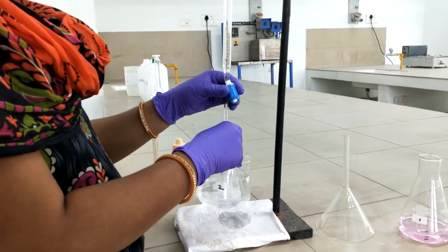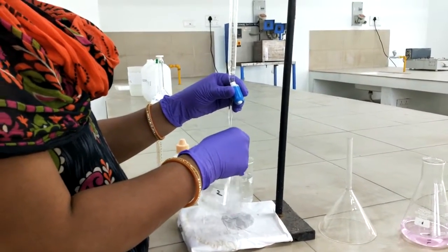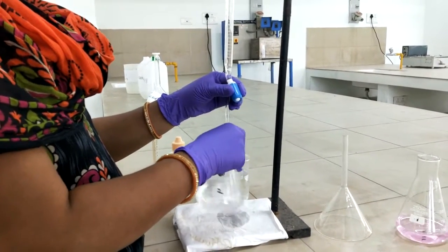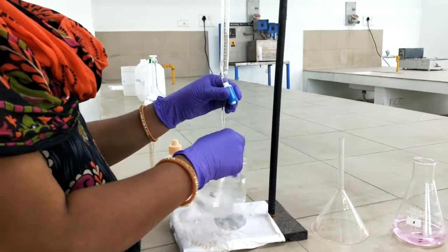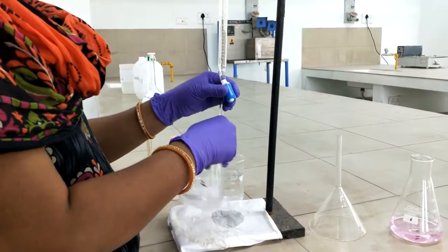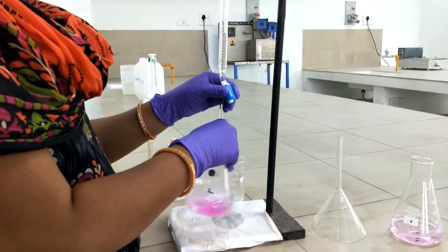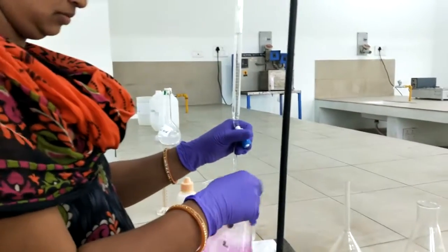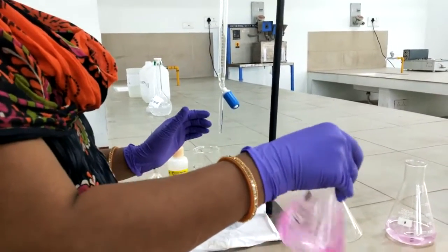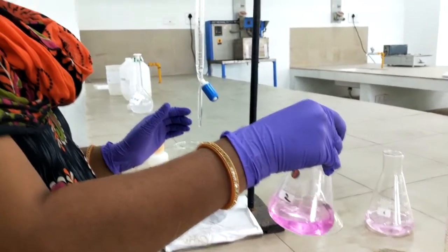We have to note down the end point. So stop it exactly when you get the end point, permanent pale pink color appearance. Okay, so please note down the end point.